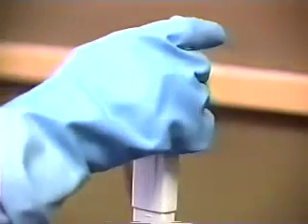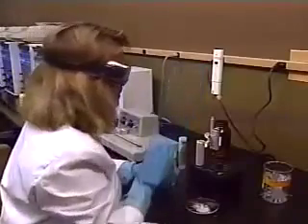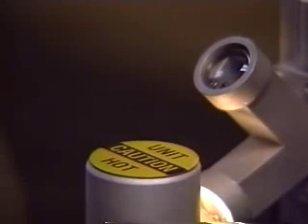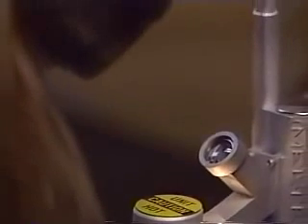Set the apparatus according to the chart in your manual and turn on the digital thermometer. Observe the sample through the eyepiece. Be careful not to touch the post in front of the eyepiece which says, "Caution, hot unit," with your face.